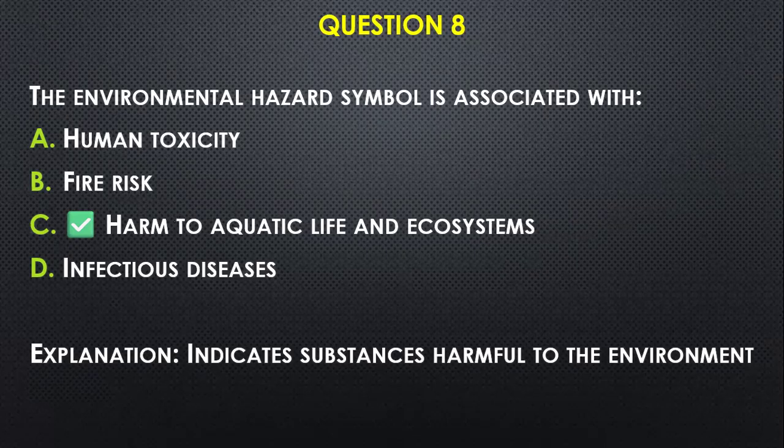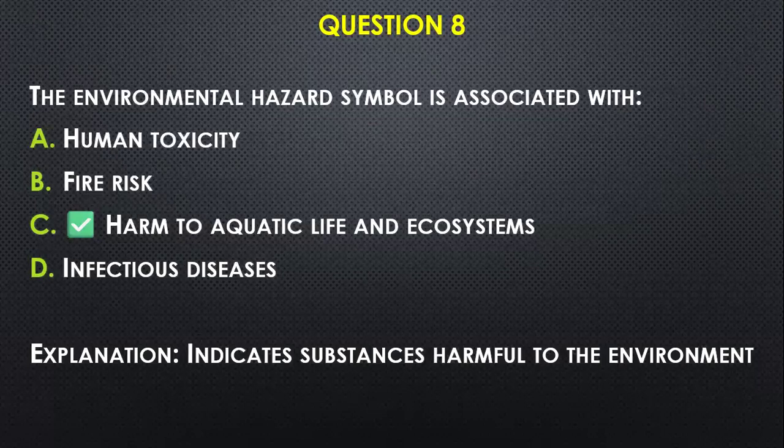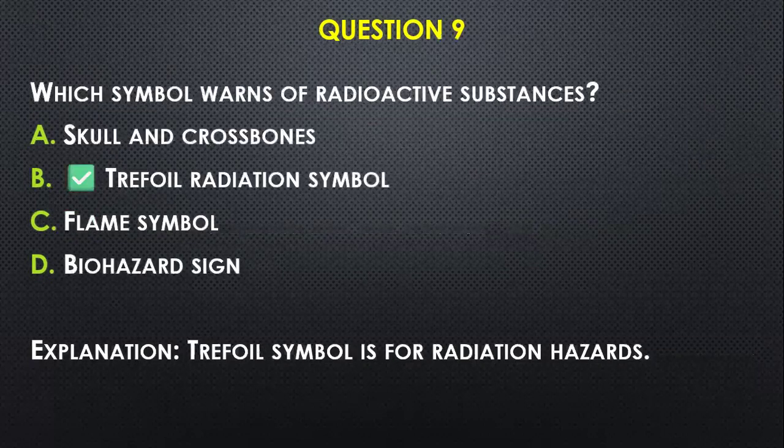Question number eight: The environmental hazard symbol warns about — A) fire risk, B) radiation, C) harm to aquatic life and ecosystems, D) infectious diseases. C is our answer, because environment is a giveaway — it has to do with harm to aquatic life and ecosystems found in the environment.